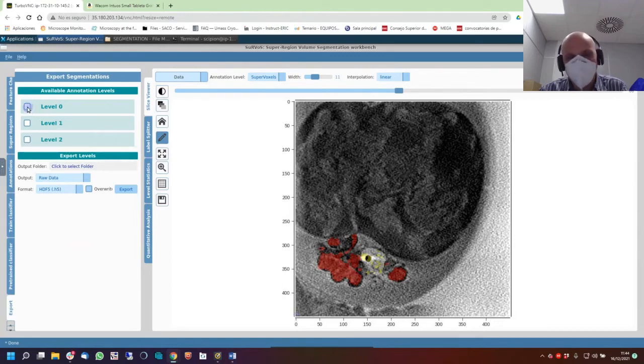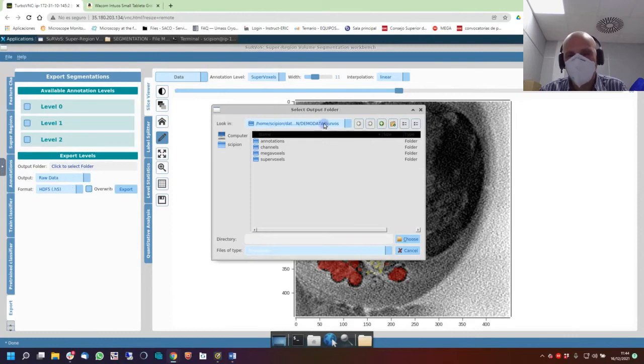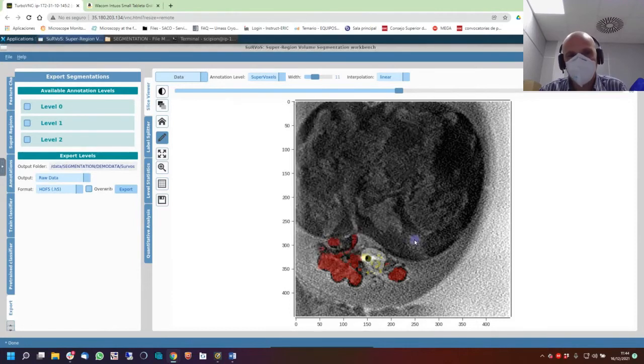Here we are going to export all the things that we have. What do we have? We have 3 labels, and inside you can select the labels that we want to export. It's mandatory to select a folder, otherwise the program will be stuck at this point and you will not get data. So select SURVOS, for example, the one that we chose from the very beginning.